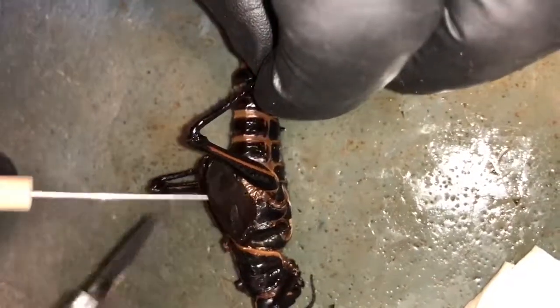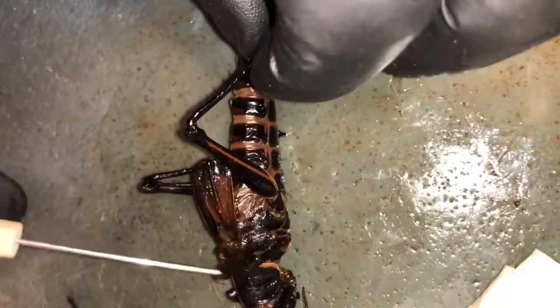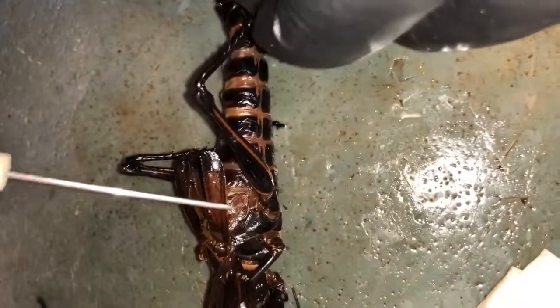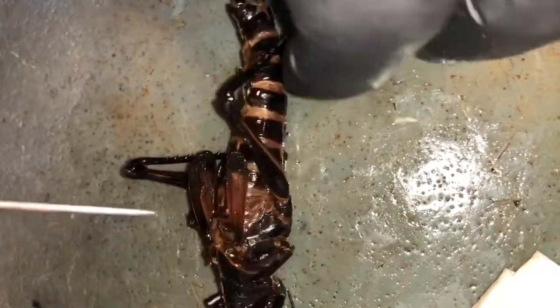And then the hind wing. We're supposed to be exposing the hind wing. There it is, the pink one. And then hold that forewing forward. Can you show me the tympanum, please? Right here. Good. How about a spiracle?